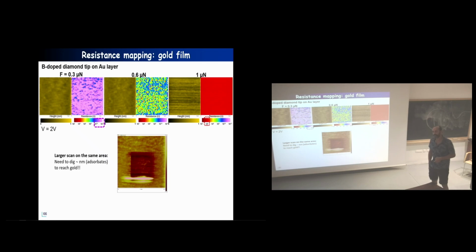Typically, for a diamond one, I don't know, but for a platinum one, at 2 milliamps, you'll start to burn everything. Of course, you're right. You don't want to apply that, but you can reduce the voltage if you want. But in this case, this is my classical procedure to characterize the probe. And believe me, I won't destroy my probes by characterizing them before the experiment.